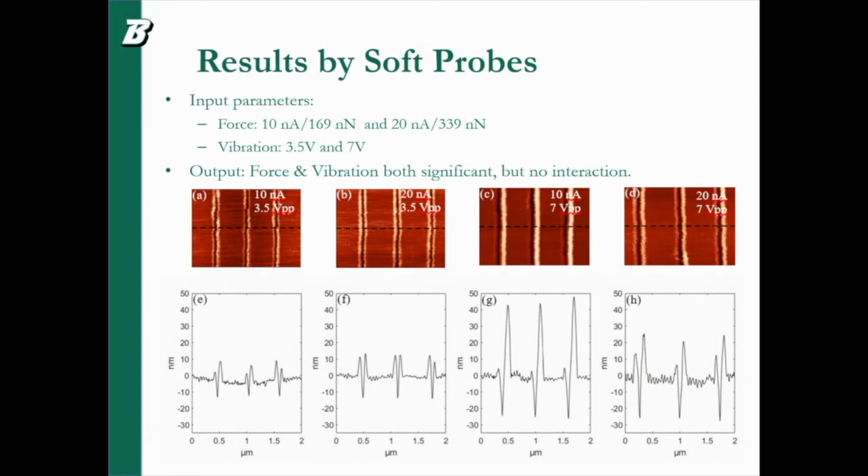However, if we use the same force, comparing A and C, but double the vibration amplitude, the width is increased a lot, and interestingly the depth actually increased a lot. So that helps the manufacturing process a lot. And so that is another thing.